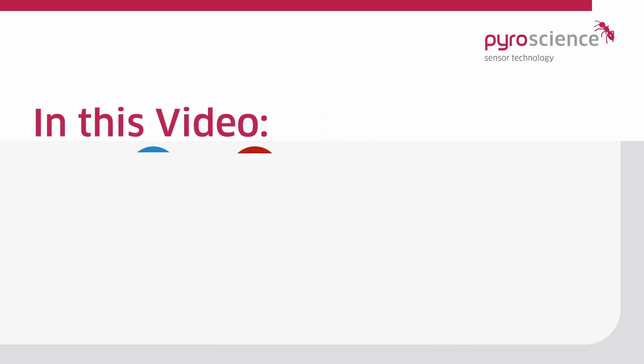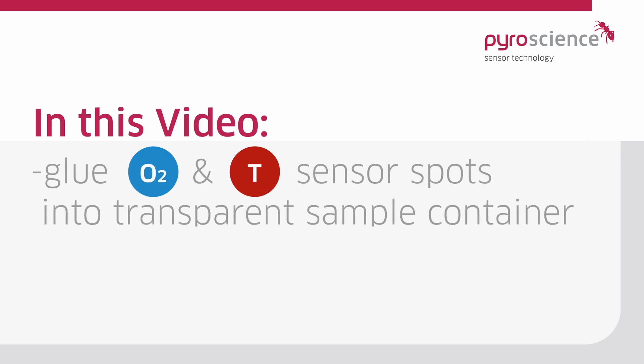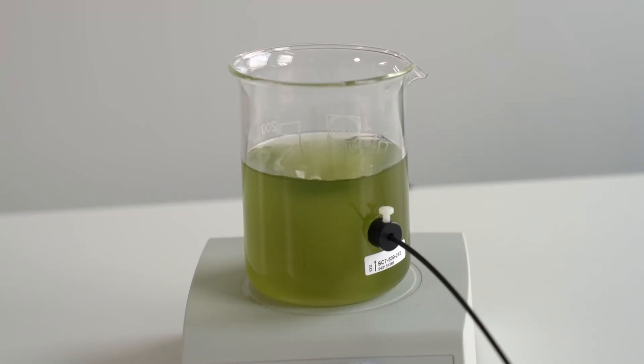In this video guide we are going to show you how to properly glue oxygen and temperature sensor spots into transparent sample containers using silicone glue. Follow these steps for an ideally fixed sensor spot in your setup ready for your measurements.